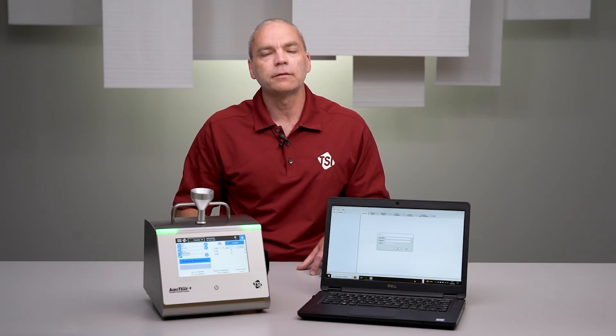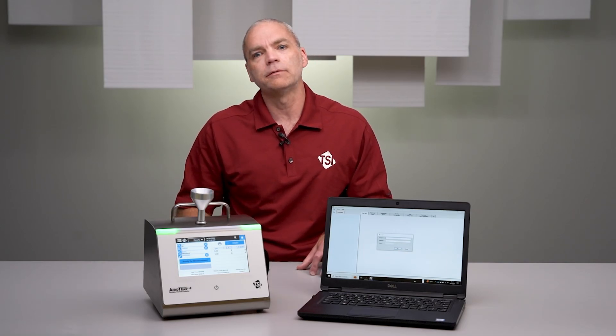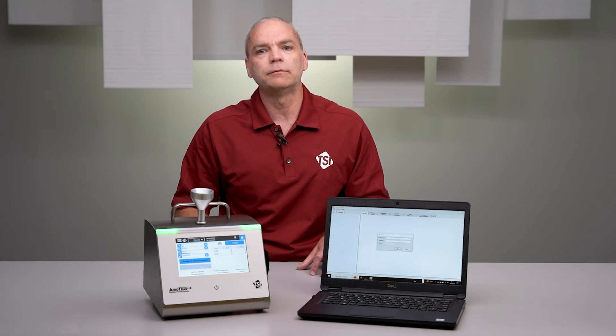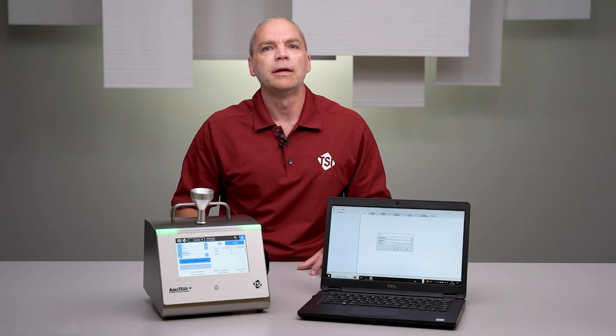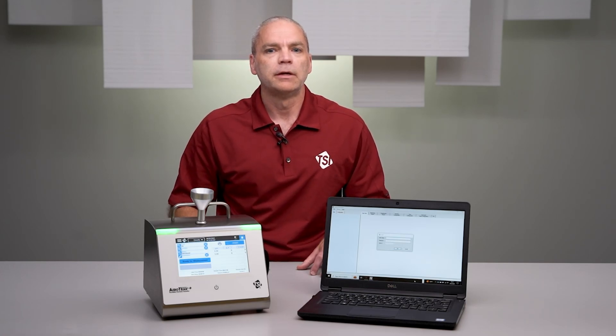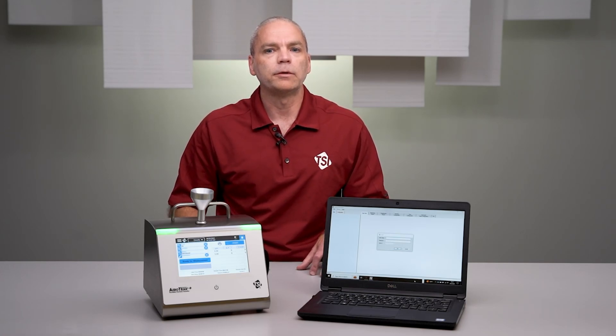TPLS provides an alternative for instrument configuration, reviewing data, and generating reports. In this video, we will look at how to connect an instrument to TPLS.